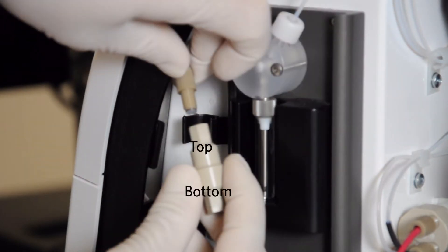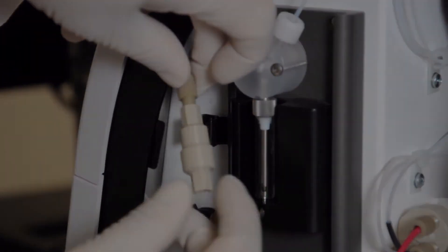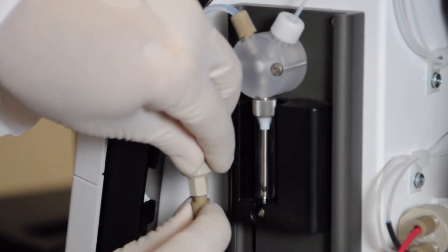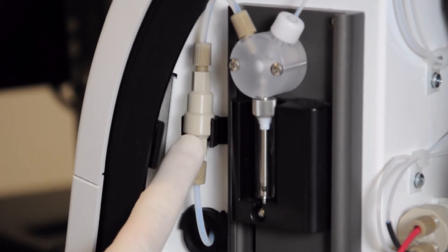Ensure the new drive fluid filter is oriented correctly and attach the top and bottom fittings. Tighten the fittings until they audibly click. Press the new filter into the mounting bracket.